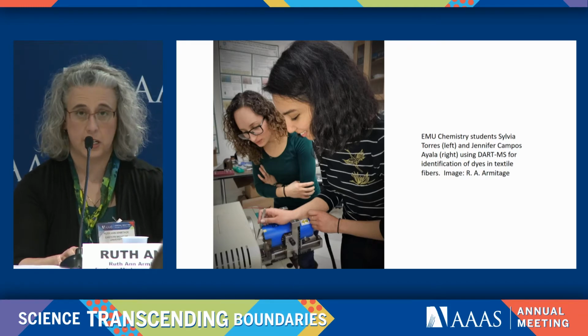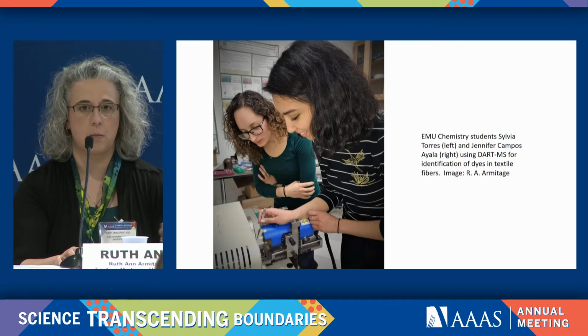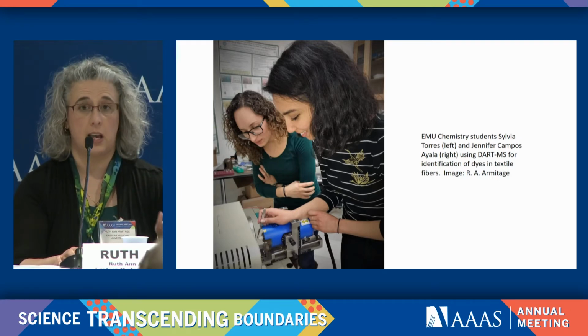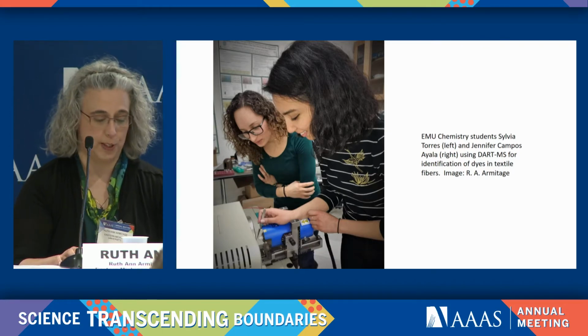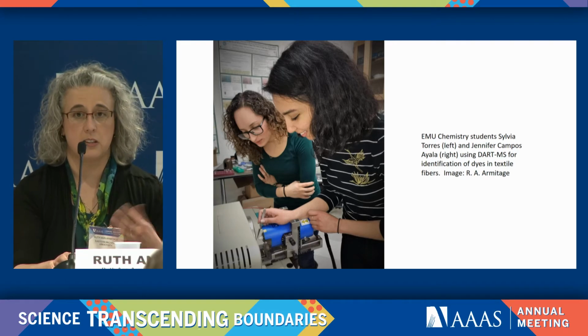By studying ancient materials, which you'll hear over and over again from all of us, I'm sure, helps us understand something about people in the past, their technology, their trade, things about what they ate and drank. So this is some of my students doing some DART in the laboratory. And much of what I'm going to talk about tomorrow is our work on identifying dyes in textiles.